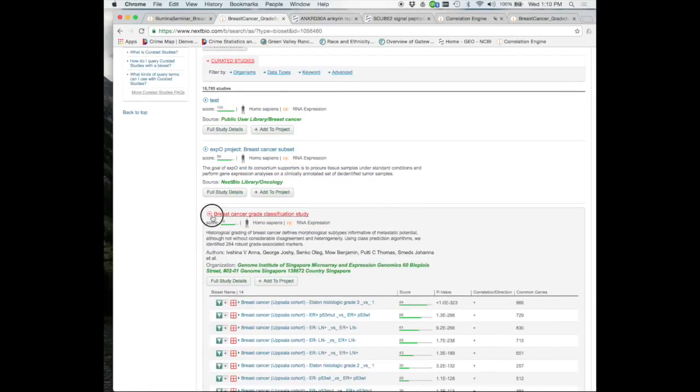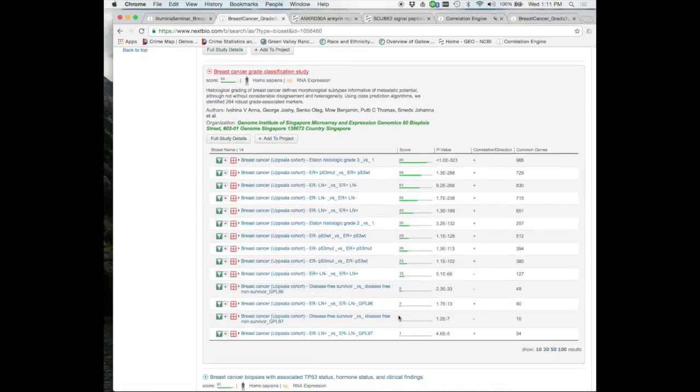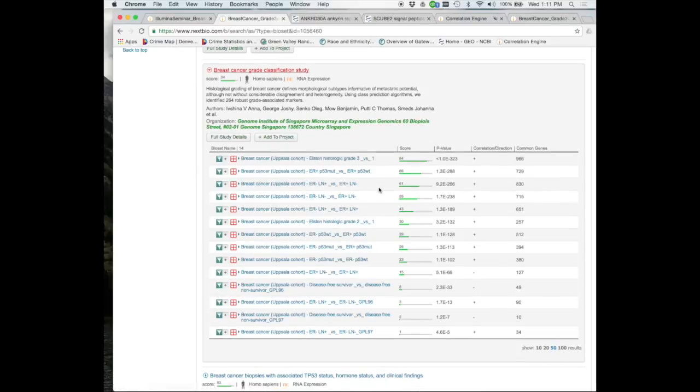Okay, so again, curated studies. This allows us to add other things to our meta-analysis if we wanted to. Oh wow, this is really close like that. Yeah.